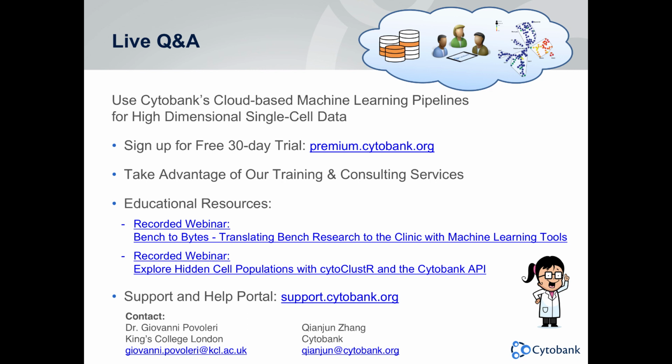There are a few publications available that compare FlowSOM and SPADE. There are slight differences in rare event detection. We just recently had a webinar with Sofie Van Gassen, the original developer of the FlowSOM algorithm. You may take a look at that webinar, and if you have additional questions, feel free to write in for more discussion.